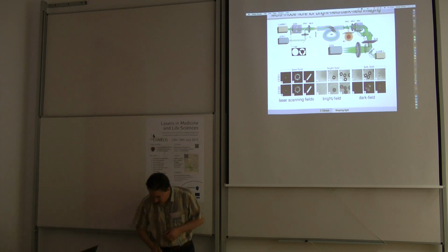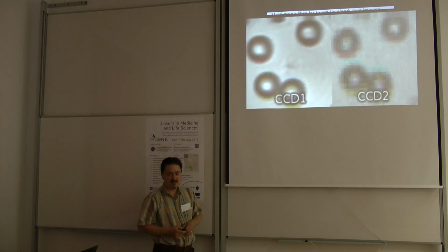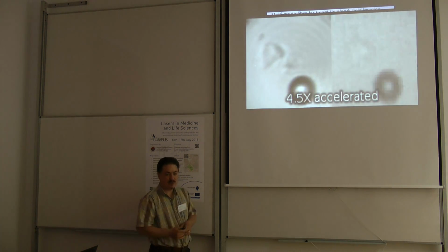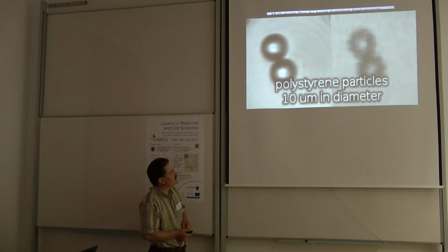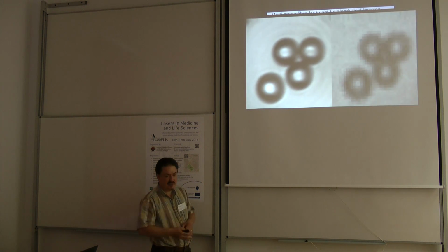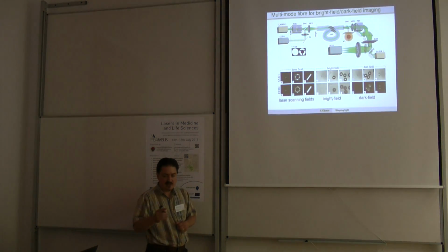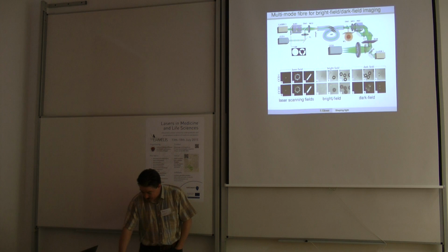And this is a comparison. This is the microscope image, and this is the image that I could recover from the fiber. Right? You can see that the resolution is nothing special, it's quite pixelated, but it shows that it's a valid concept, it's possible to do. It was the first demonstration of imaging with a bright field equivalent at this speed. So it's passive, it doesn't require any scanning. What it needs is single frequency, but it can be spatially incoherent. So you can use a scattering, your rotating diffuser, as was introduced in the last talk.